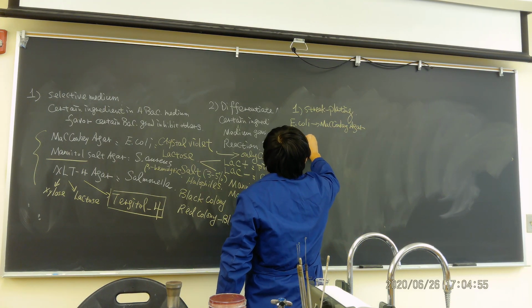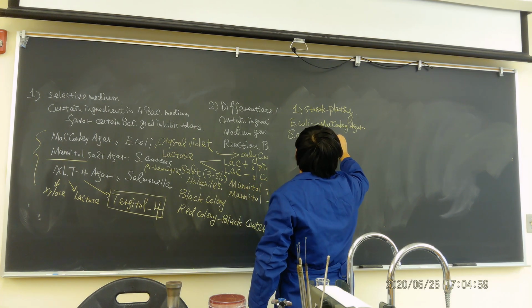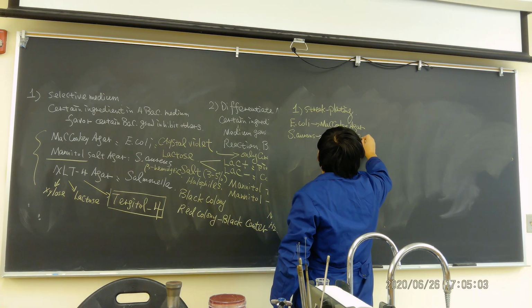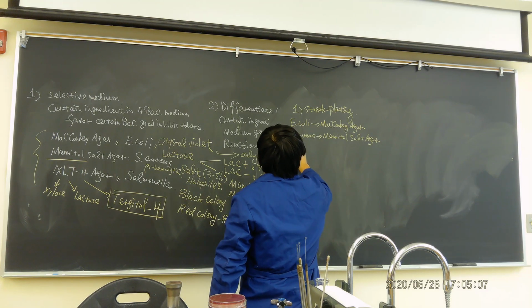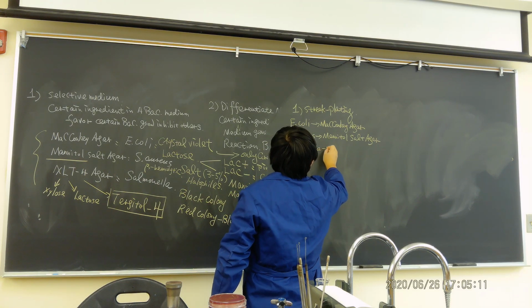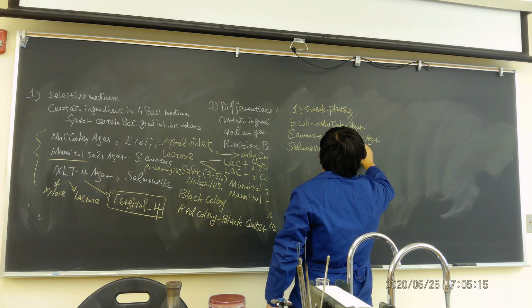Staphylococcus aureus, Mannitol Salt Agar. And Salmonella, XLT4 Agar.